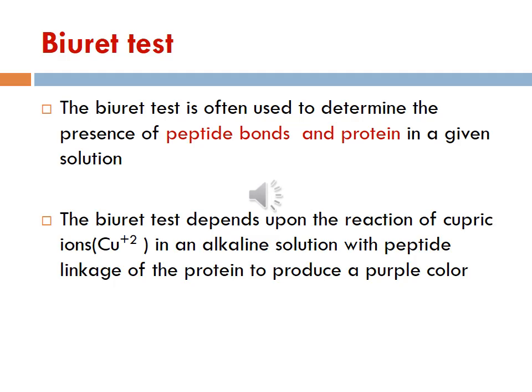A Biuret test. Before we start our lab today, we are going through a quick review of our previous lab. In our previous lab, we took an introduction to proteins and amino acids. Amino acids are the building blocks of proteins.